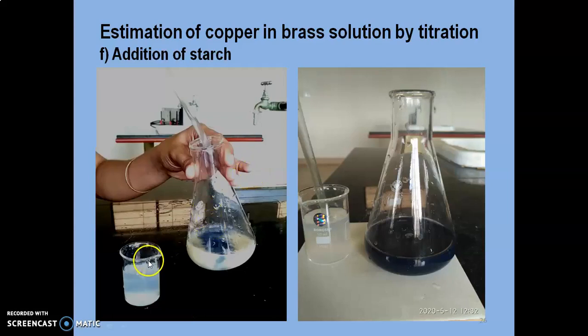To the pale yellow solution, or the pale yellow mixture, we need to add the starch. Upon the addition of starch, we will end up getting starch iodide complex. And iodine will be in its least concentration.